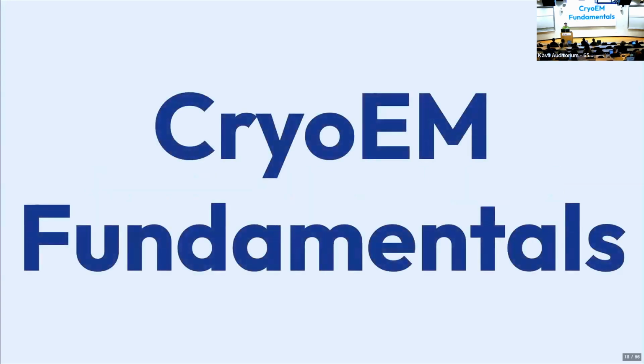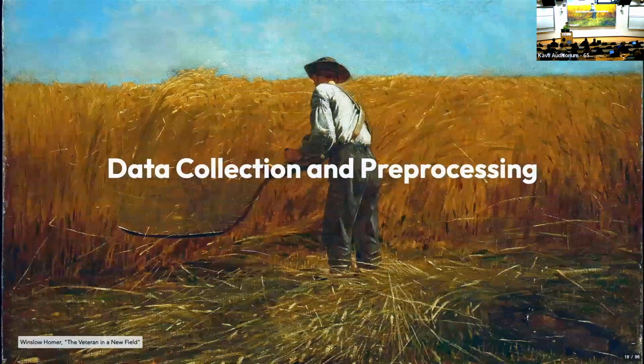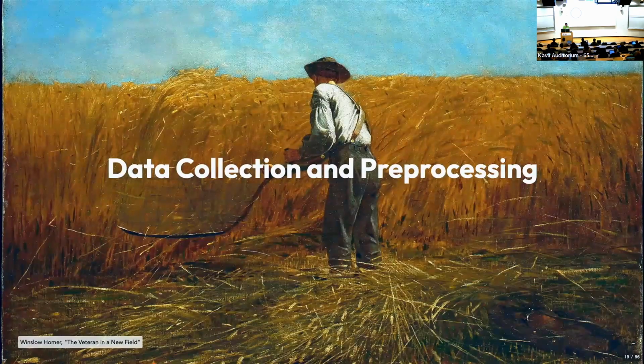Okay, so with all that out of the way, we can start to talk about cryo-EM fundamentals. Make sure I know how to read my watch. Okay, so first, let's talk about data collection and pre-processing, right? This is kind of the very first step of any cryo-EM image processing pipeline, is getting the images that you're going to process. And unfortunately, there's a lot here that's wrong, but some of it we can correct with software.